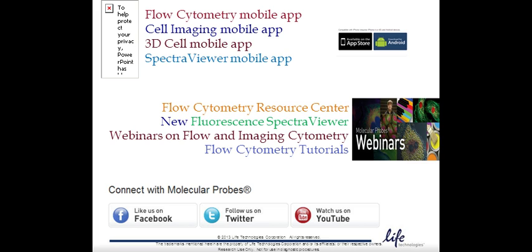So you have to be aware, if you have stem cells that you're labeling with DyeCycle Violet or with Hoechst, that the dye can be pumped out. This efflux can be blocked with verapamil or some other blocking agents to prevent the dye efflux, and then you'll get an accurate DNA content analysis in these stem cells.